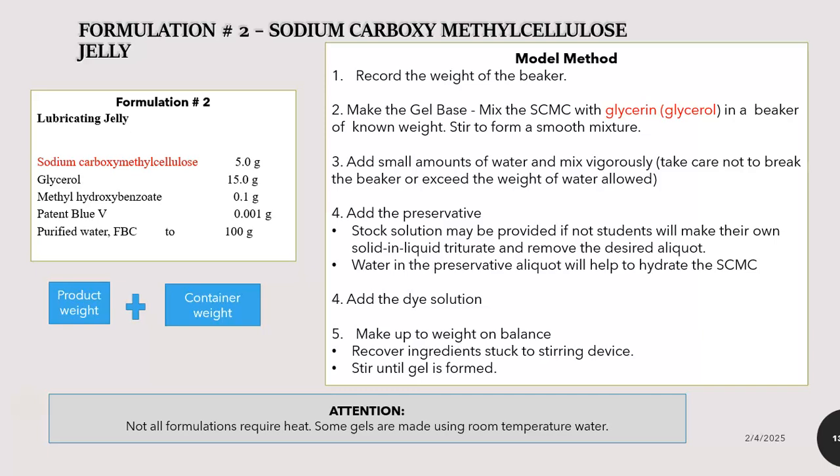And then in that case, you can weigh your gram of water. 1 gram of water is equal to 1 mil. Now, of course, you can pre-calculate your water, because for really very dilute solutions, we treat 1 gram as 1 mil. So depending on the density, look at glycerol.